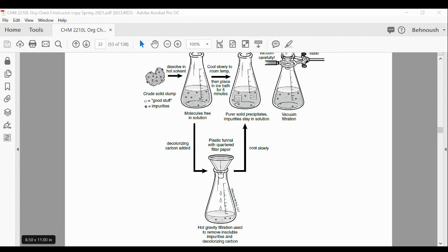If they don't use this handle or the straw or stirrer, if you've seen the ones that are loose and not in this shape, they put a piece of string in there, and then that string acts as the seed. So crystals form there. When you're talking about crystals, you see the organized shape of the sugar coming from the sugar powder. Now, if you don't cool this down slowly, the size of the grain is going to be the size of sugar, not the rock sugar.